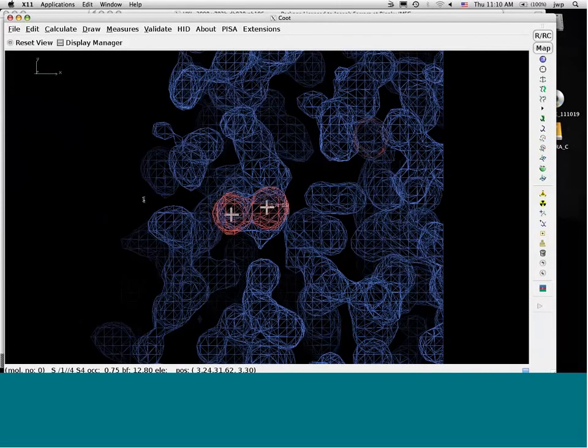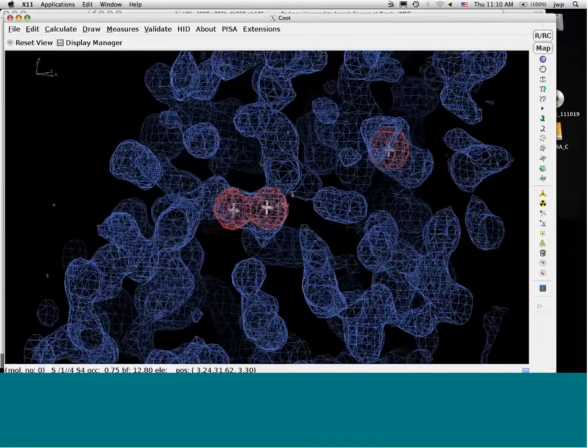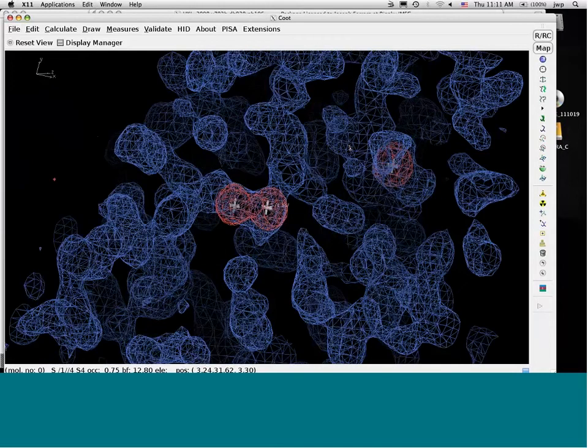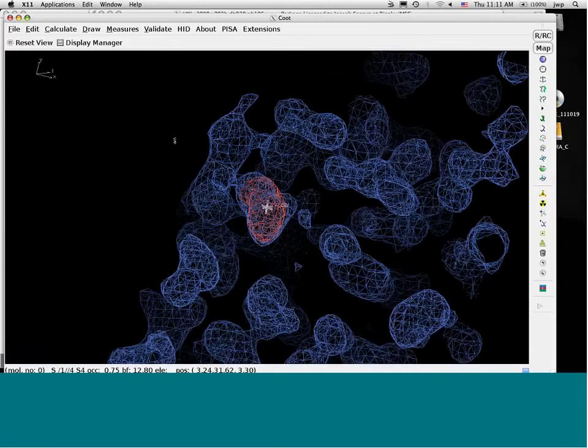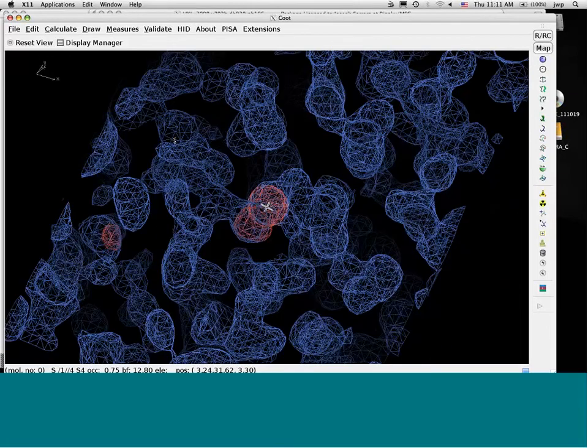Okay, but if you collect fast and with high redundancy, more things can go wrong, I personally think. I'd rather get the data that I know can do the phasing as quickly as I can. And speaking to that, I know of examples in our lab where we've cut back some of the data, and shorter data collections have been more successful than using all the data where you might have damage.